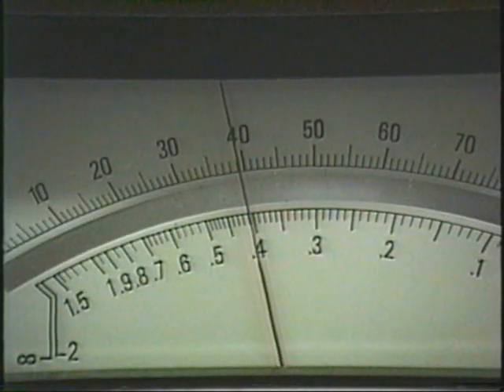If you see the reflection of the needle in the mirror, you have to move your head. And if you still see it, you should close an eye. Now let's take a look if we move the camera so it in fact will give us a parallax error. Remember, we're reading right now about 39.2.